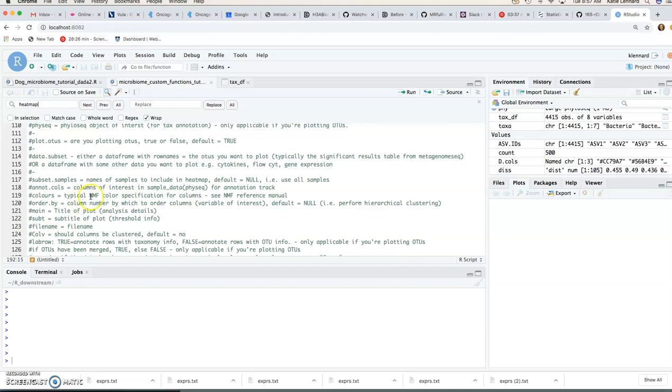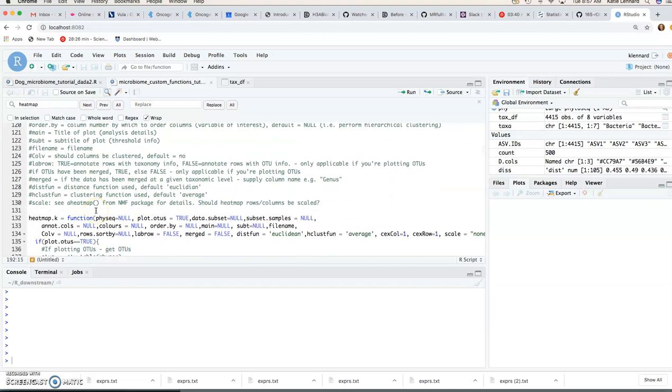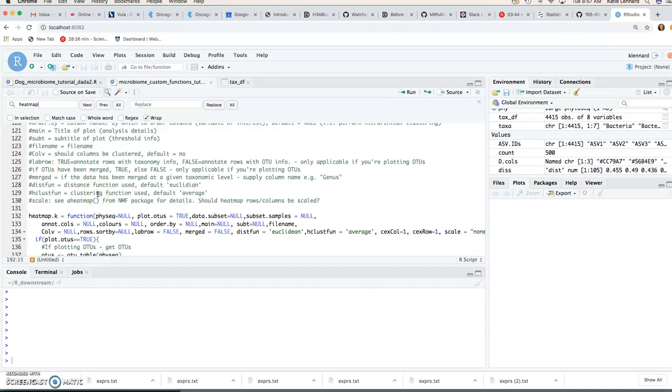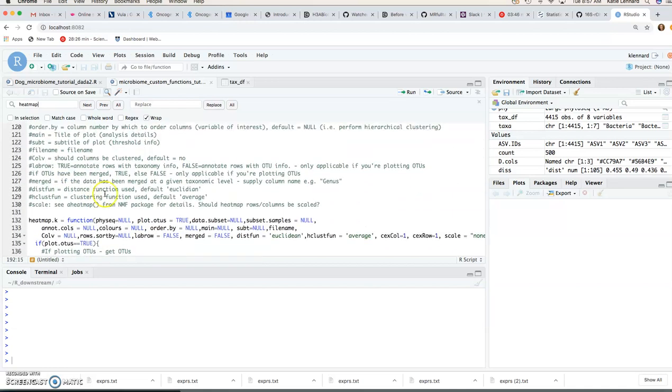So the default for the aheatmap function that you find in the NMF package is to perform Euclidean based hierarchical clustering. So you can choose both the distance and the clustering function but as we've discussed this is not ideal for our type of 16S data. So instead we're going to use Bray-Curtis distance to calculate our sample order and then manually specify this to the function.